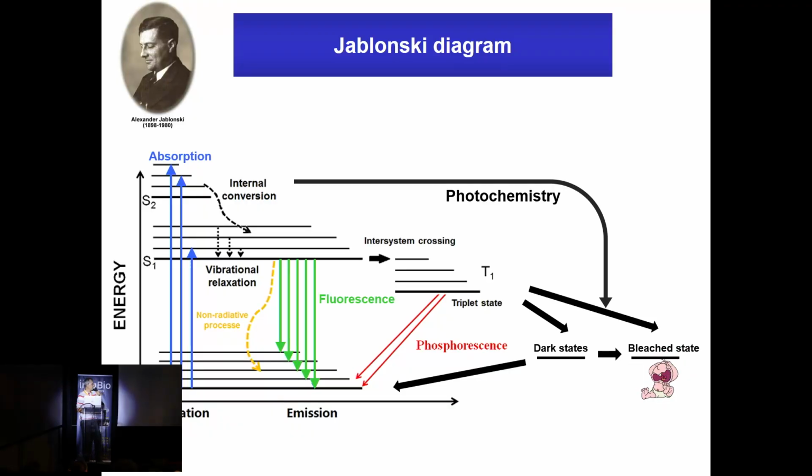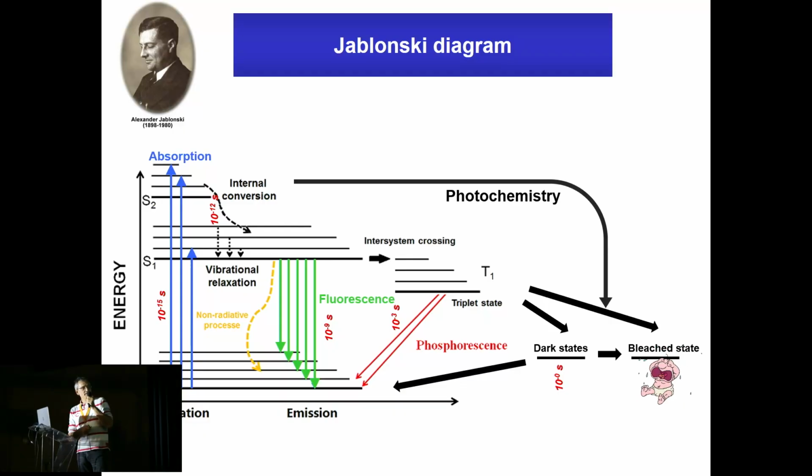So these events can, to a lower extent, actually originate from singlet states also. In terms of timescales, it's important to put these events on timescales. So this absorption is instantaneous. Internal conversion, vibrational relaxation, that's picosecond timescale. Fluorescence, that's nanosecond timescale, and that's very important because nanosecond is essentially the fluorescence lifetime.